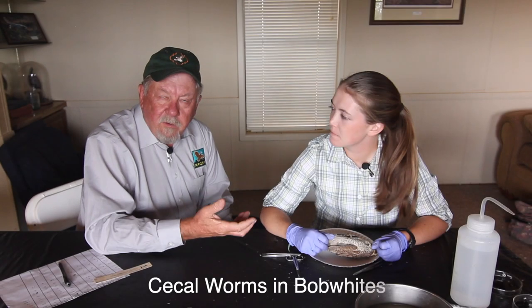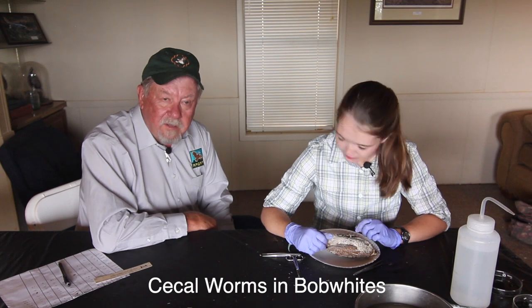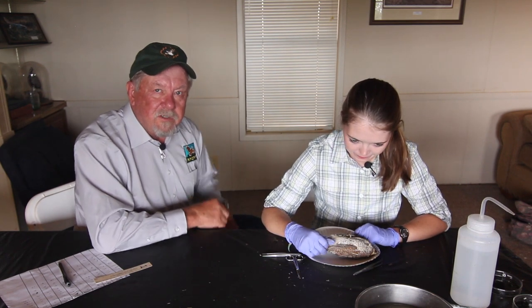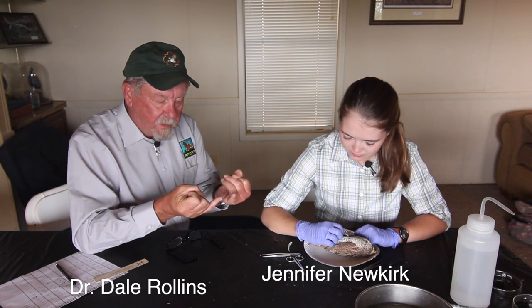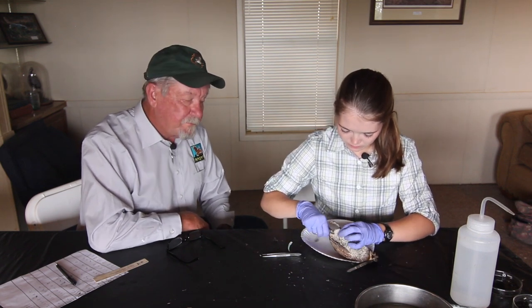So in addition to the eye worms, one of the areas of focus, no pun intended, is the ceca, or the midgut of the quail. At the junction of the small and large intestine are two little blind pouches called ceca. Typically, they're a little bit longer than your little fingers, and in a fully developed ceca, they'll be almost that size and diameter. So Jennifer's going to open up this bird, and we'll see what the ceca look like, and then she'll tell us about the technique for how to dissect the ceca and determine how many cecal worms occur.